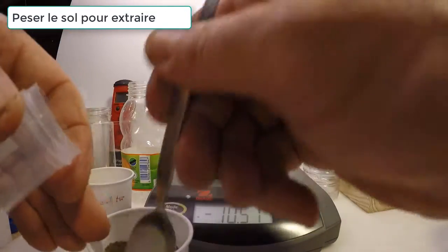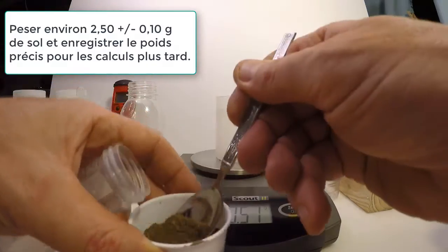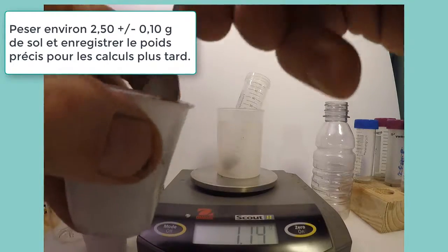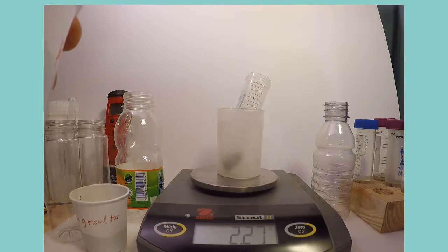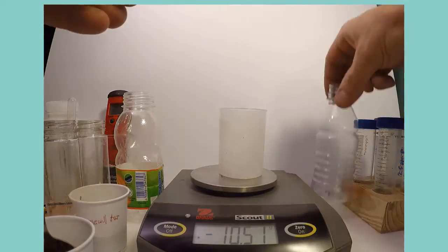The first step in the procedure is to weigh out 2.5 grams of soil, which can be either field moist or more usually air-dried soil. Here I'm going to weigh out 2 samples because I want to show 2 different filtering methods later on in the procedure. The precise weight of soil should be noted down to be used later in calculations, in this case 2.56 grams.